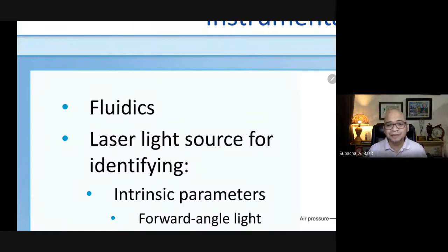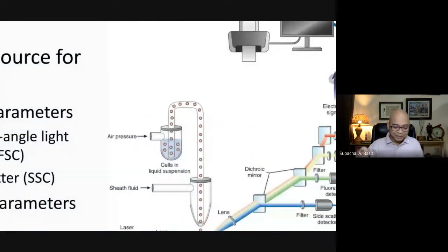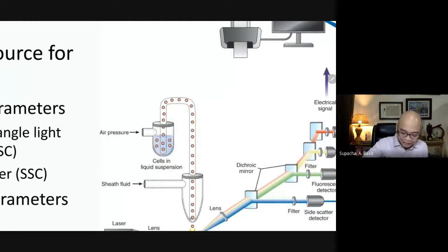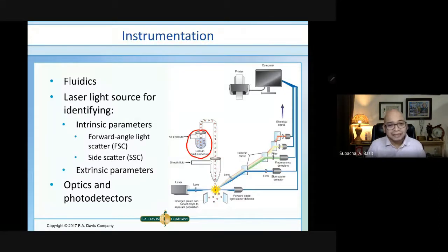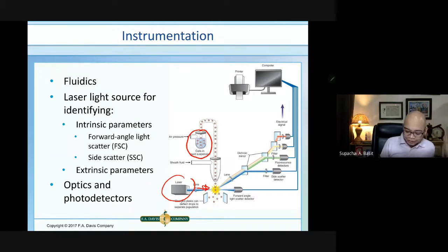A while ago, we have already defined the fluidics. These are actually the cells being suspended in a liquid suspension. So this is what you call the fluidics. And then the laser light source. So you can see here that this is now the laser light source.